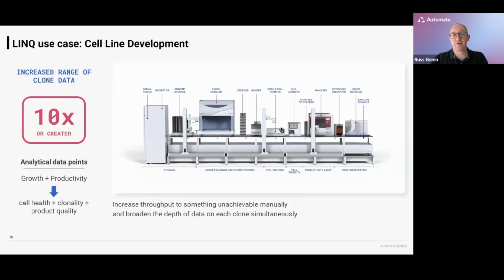So we have a single cell printer to work up the very top end of this process and dispensing a single cell into every well of a plate. We then also have an imaging system that is now a little bit more tailored to cell line development, measuring clonality as well as some of those core measurements about confluence. And further to that, in this case, we've added on a device for carrying out some productivity assays or product characterization assays. In this case, a Sartorius Octet.